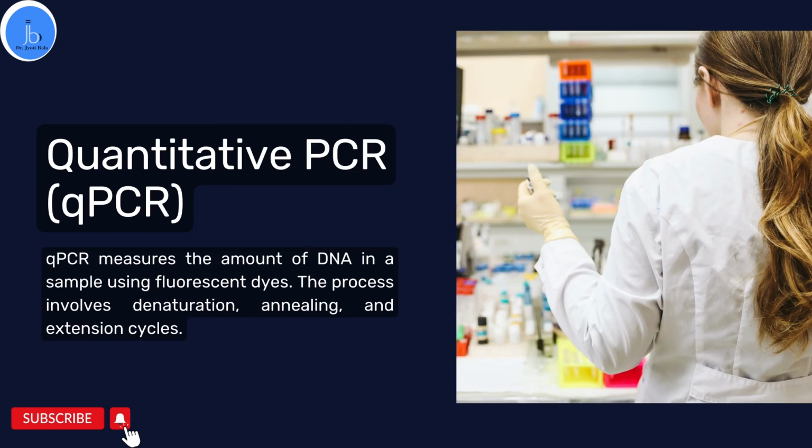Another significant PCR is your quantitative PCR, which is also called qPCR. qPCR measures the amount of DNA in the samples using either fluorescent dye or other alternative dyes.